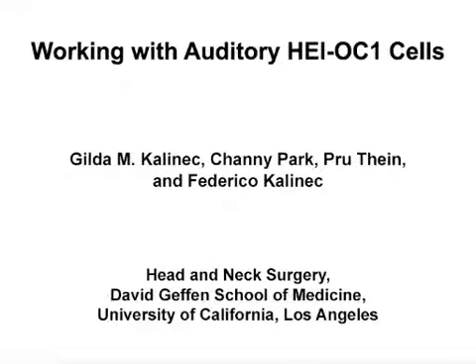The overall goal of this protocol is to describe the basic procedures to work with HEI-OC1 cells, which can be used to study the effects of pharmacological drugs on auditory cells, and assist in the functional characterization of the motor protein prestin.